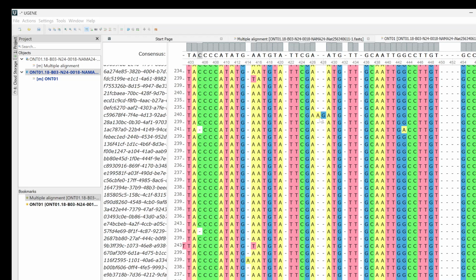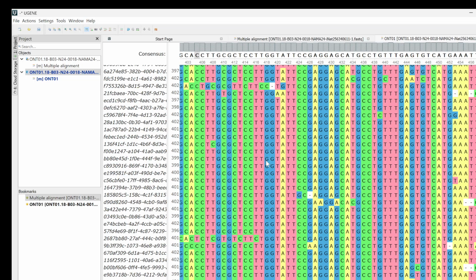So anytime you have one of these where 90% of it or more is white empty space, it's just going to delete it. And you'll see what happens. It's going to take a minute. Usually, it's one of those things where you just have to let it do its thing. If it goes for longer than a couple of minutes, then it might freeze your computer or something. But here we go, we're all done.